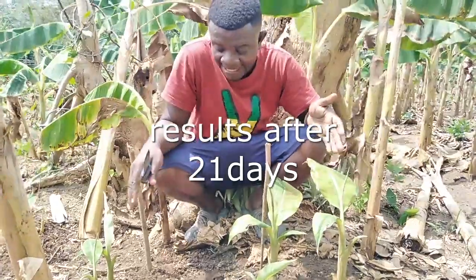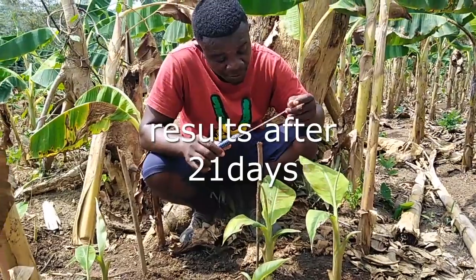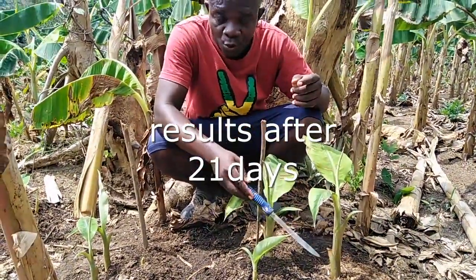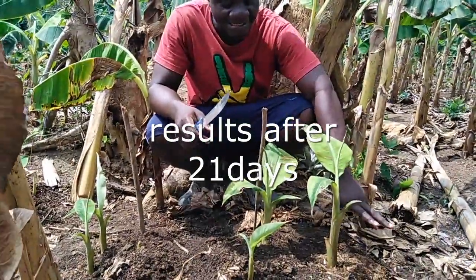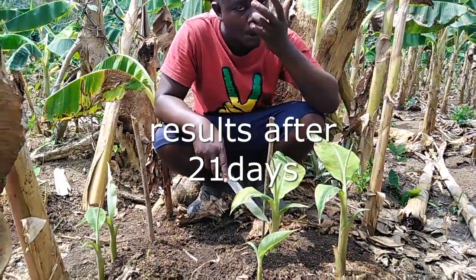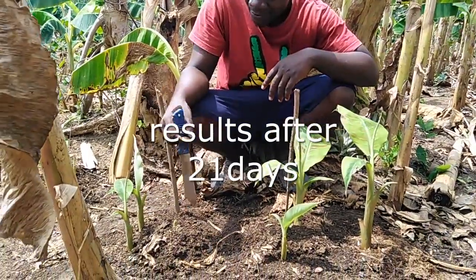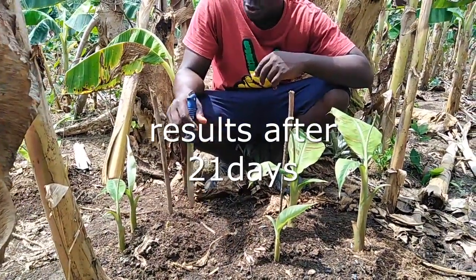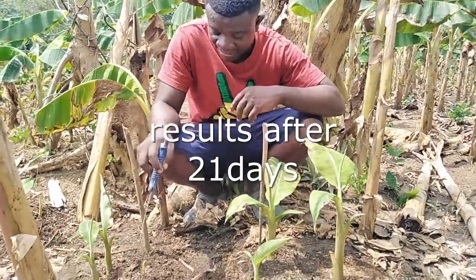We had our three treatments here. This one is diluted — we used diluted coconut water to inject this tissue. Here we used the undiluted coconut water, and here we didn't use anything, so this one served as the control of the experiment, meaning we did not add coconut water here.